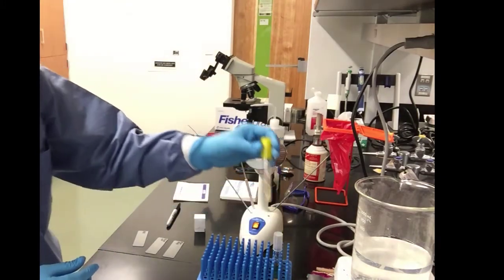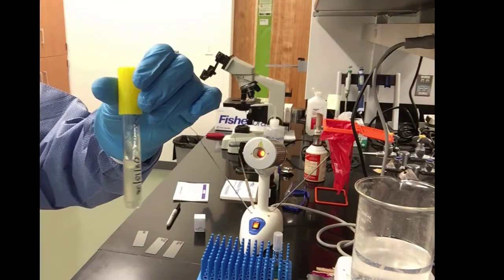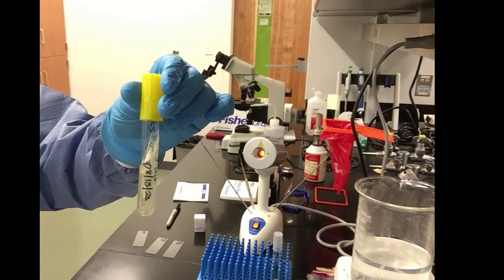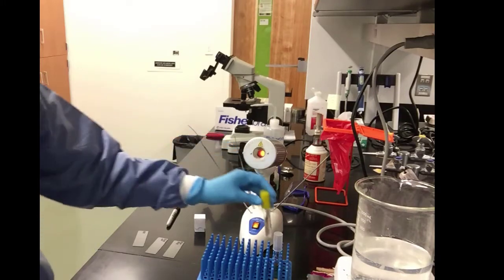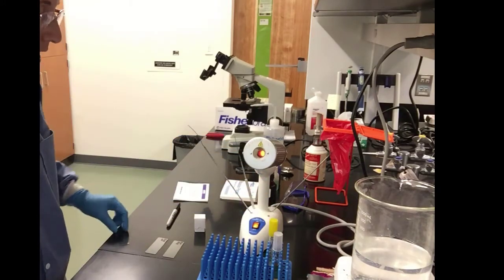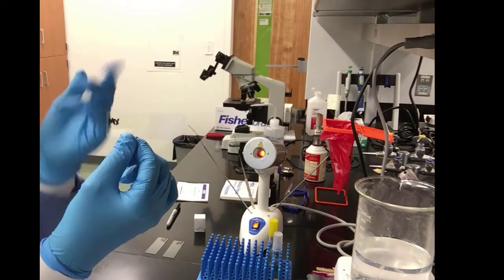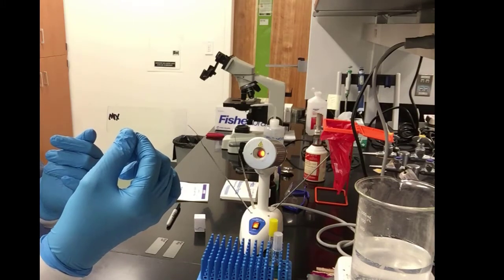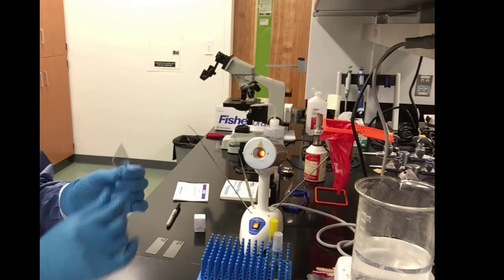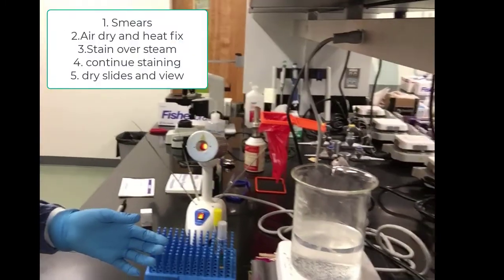We will be placing Staph aureus on our slide. Notice the staph is growing on a solid, whereas the Mycobacterium was growing on a liquid. So we're going to have to add a drop of water when we make our smears with that solid bacterium. And here's the mix. Again, you stay on the left side, you don't label in the middle. We will be placing and smearing both staph and Mycobacterium on that slide.